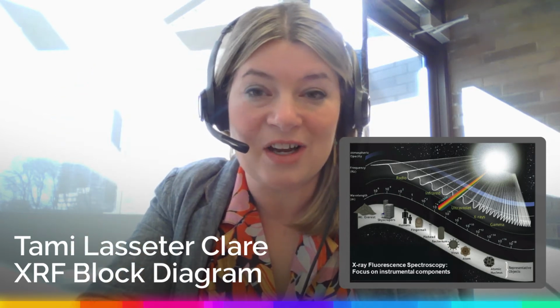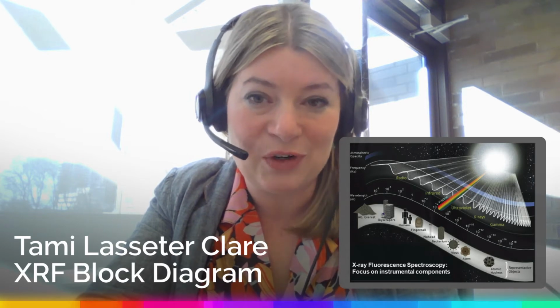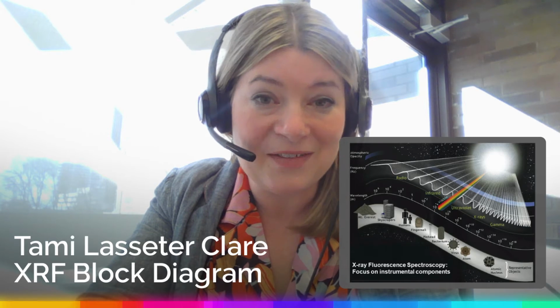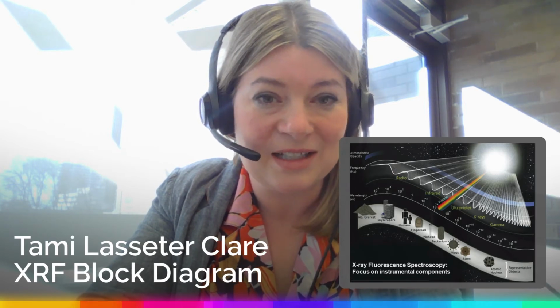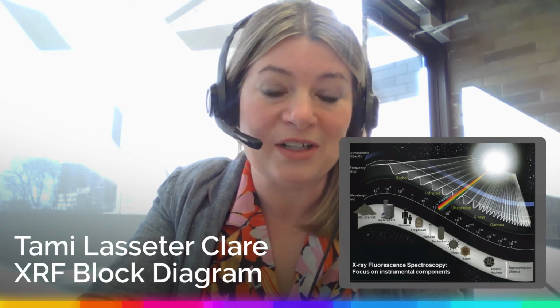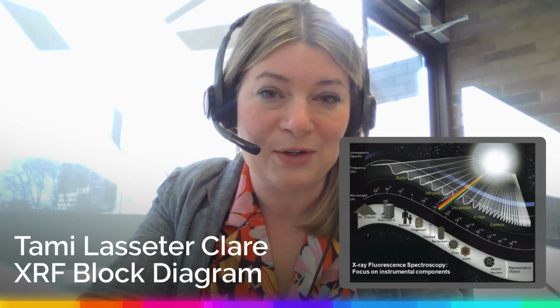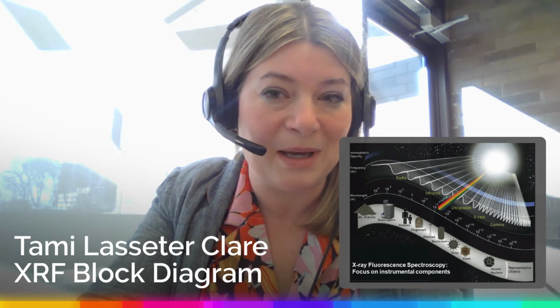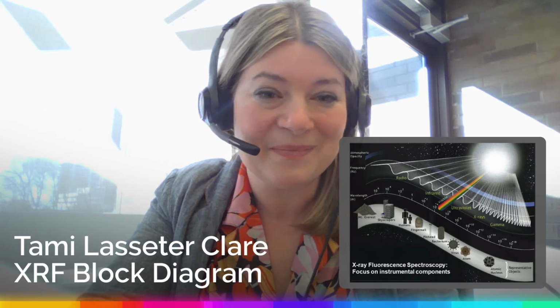In this mini lecture, I'll describe how X-ray fluorescence instruments work by describing each of their components. By the end of this lecture, you should be able to understand how the instrument generates X-rays, how the energies of secondary X-rays from your sample are measured, and to gain a basic understanding of different instrumental parameters that can be tweaked to optimize sensitivity for certain elements of interest. Let's jump right in.